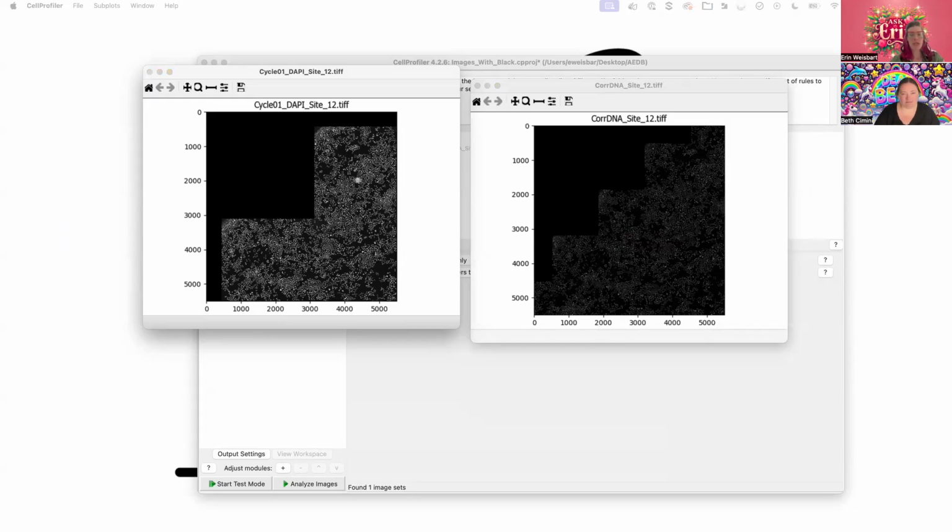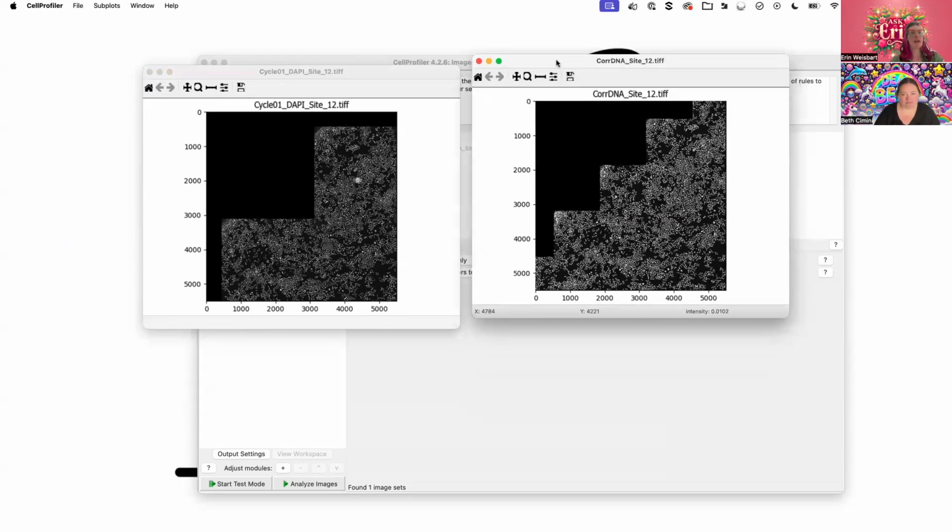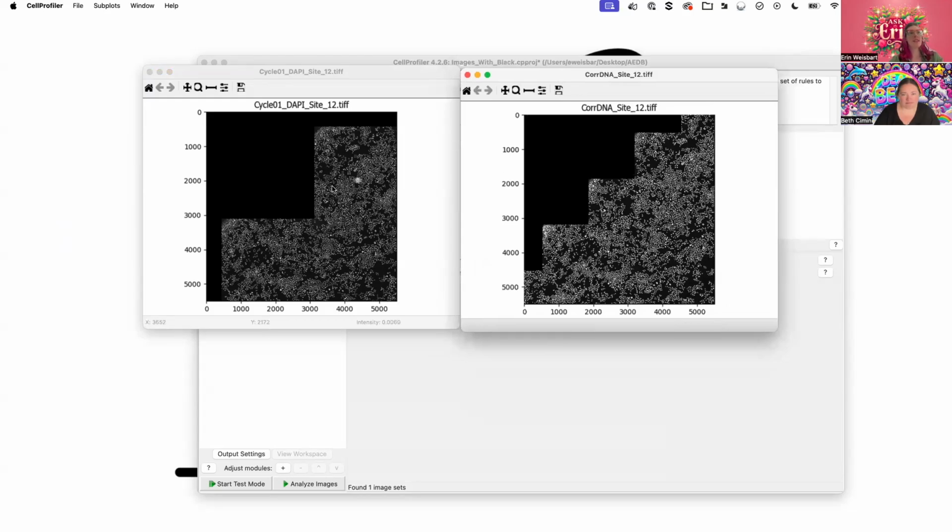In this experiment, these two sets of inputs were taken at different magnifications. And then all those images were stitched together, but that's why they have a different pattern around the edge here, as the microscope was actually using different physical objectives for this acquisition. And then to bring them together, we stitch them into a whole well, size them the same, and then crop them into chunks.